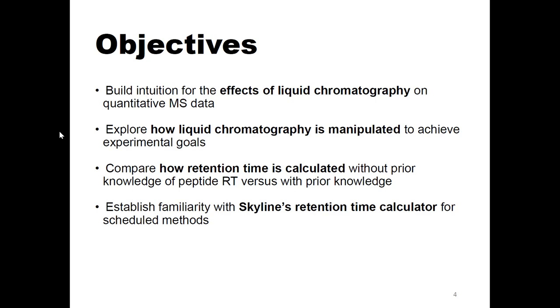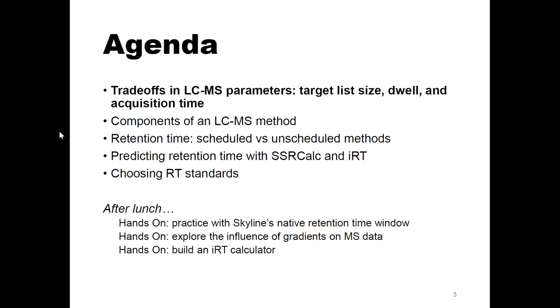And then finally, we'll be doing this after lunch, so you don't have to worry about it yet. We'll be building some familiarity with Skyline's retention time calculator, and I'll be showing you some tips and some screenshots here that you're more than welcome to open up one of the Skyline files on your flash drive and kind of play along with changing between these views.